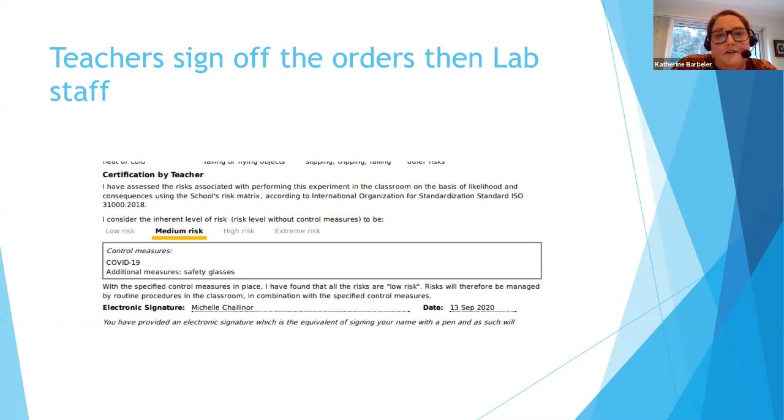The experiment we were doing was a version of elephant's toothpaste, for reaction rate and the use of catalysts. They obviously got results using the 3%, but it wasn't the way it should be. So when I went to the 6%, they weren't allowed to use the 6%. That just gives you an example. Concentrated sulfuric acid is another one that our senior chemistry students often need to use in the organic lab, for example, making esters. That's teacher use only.